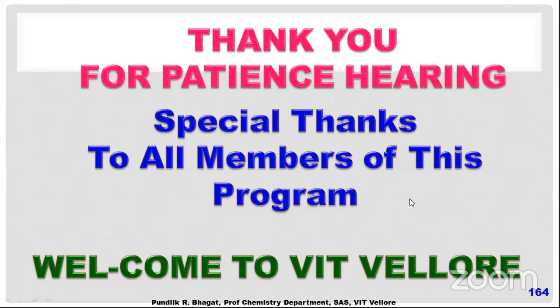Sir, are you talking about two NH2 peaks, or about two lambda? No, I'm talking about two lambda maximum values. Why do two lambda exist? As I told you, sometimes if the sample is not pure, it may show. No, the sample is pure, I'm confirmed. But if the sample is not pure, it may happen. If there are two lambda peaks, it may be because of some pH difference. As I told you, the isosbestic point sometimes shows two lambda max. In that case, we need to decide the pH at which it will give.